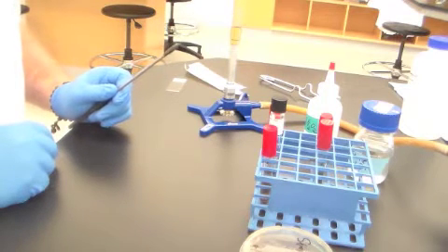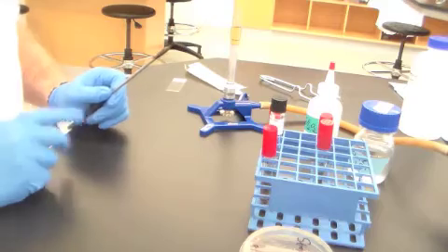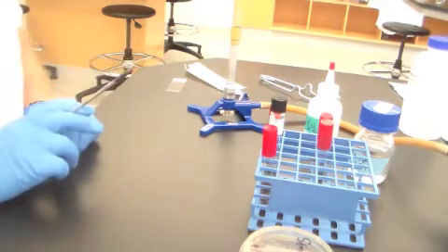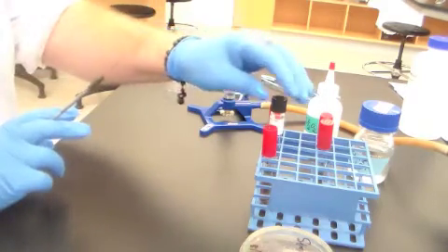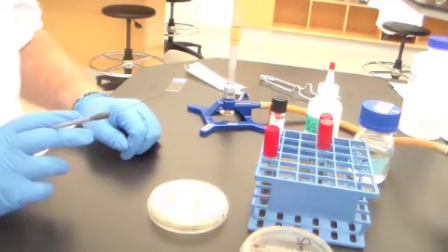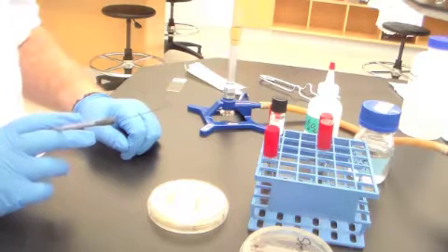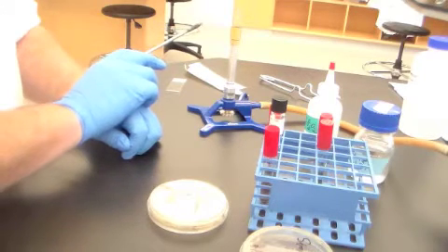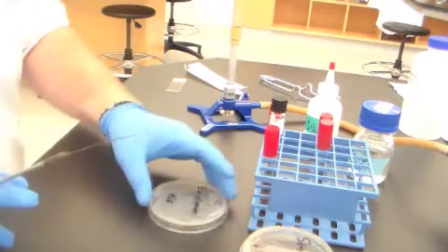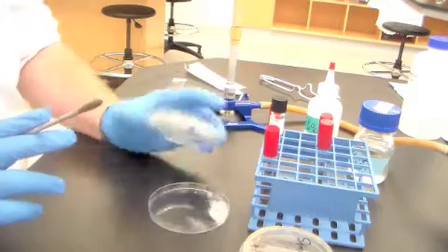So this is one of the things about microbiology, is that oftentimes we have to wait for the organisms to grow in order to see the results. So this week you're going to inoculate media that's going to allow us to determine whether a particular bacterium has the ability, for instance, to decarboxylate one of two different amino acids. So each of your lab groups is going to inoculate 3 different bacteria. I'm only going to do one for demonstration purposes.